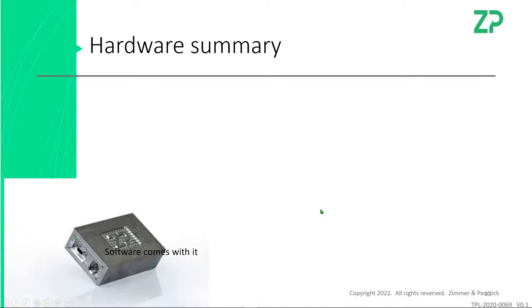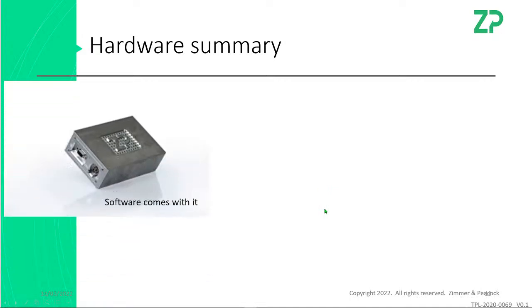So if I was to summarize the hardware, I understand the question, which is you want to measure the dielectric properties of a cell suspension. Cells have membranes. Membranes, whether the cell is viable or non-viable, will have different, let's say, capacitances, and you should be able to use it in a machine like this to do it.